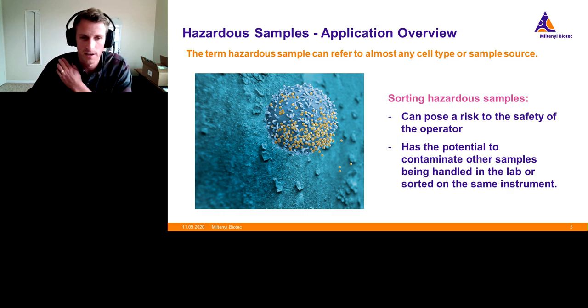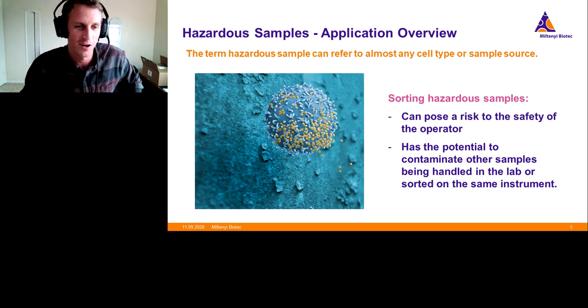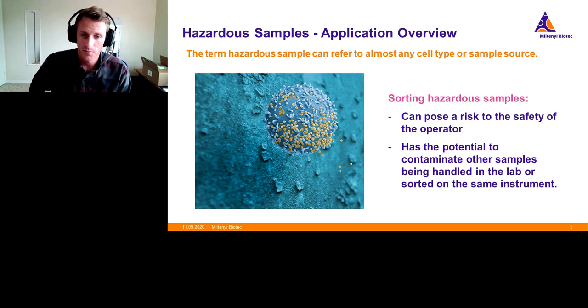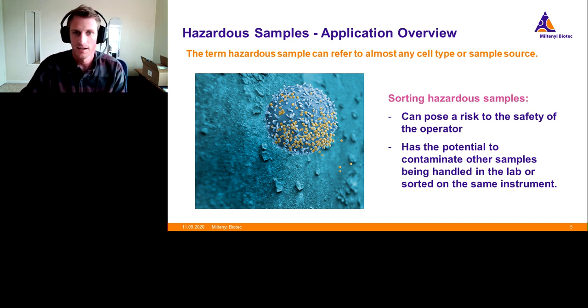So in the interest of getting everyone on the same playing field, I'll do the classic intro speech where you talk about the Webster's Dictionary definition of a hazardous sample. It's really what you think it is. It's something that has the potential to pose a risk to the safety of an operator, or something that might contaminate the system itself. And we'll see that both of those pose significant risk when you're talking about something as infectious as COVID, or as scary as some of these BSL-3 and 4 microbes that individual labs are working on.